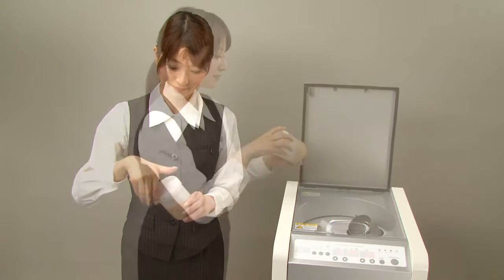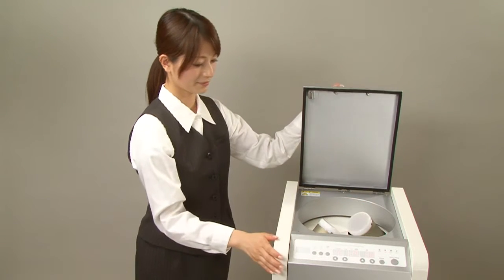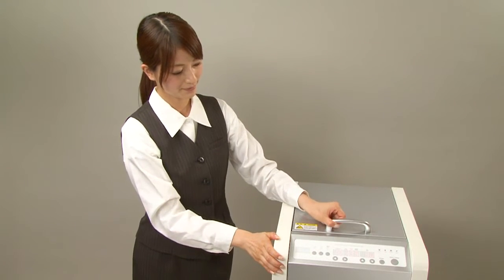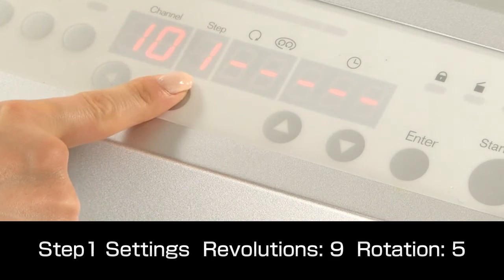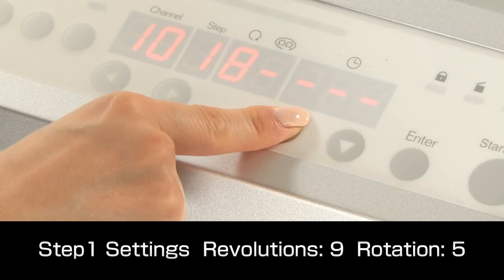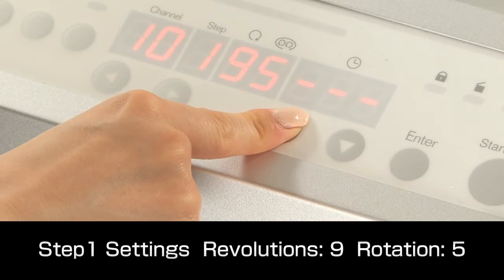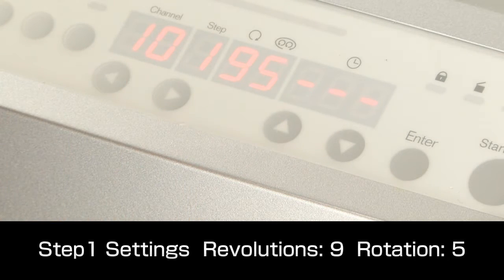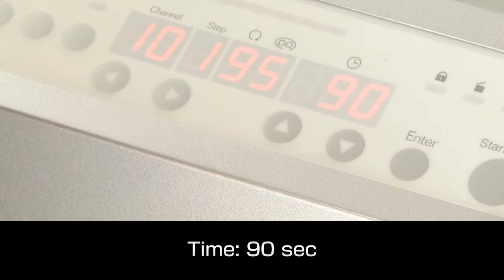The container with the materials is set in the holder and the lid is closed. Generally, when mixing materials, rotation speed is set to about one-third of the revolution speed. But because this material is highly viscous, revolutions are set to speed level 9 and rotation to speed level 5 in order to increase mixing force. The mixing time is set to 90 seconds.